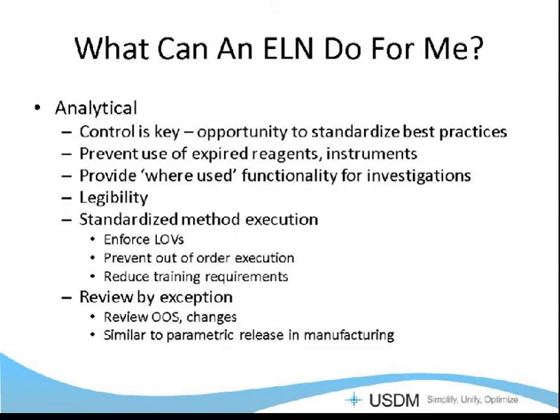In the analytical area, it's basically the opposite. You know every time you do an experiment what it's supposed to be. There are standard procedures that exist that are supposed to be followed. So in the analytical area, generally you want to impose controls on the execution of the ELN so that everyone follows a standardized process every time. This is an opportunity for you to implement your best practices if you find that people are doing things their own way and you have issues with them not following procedures. If you have a standard process, then it conforms everyone to the same way of doing things.